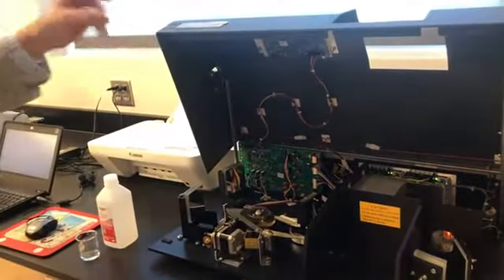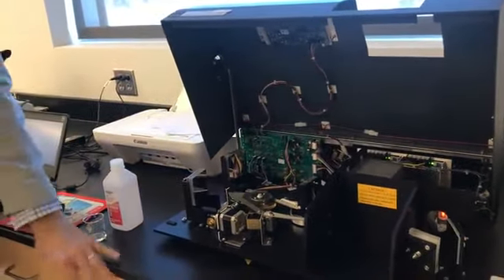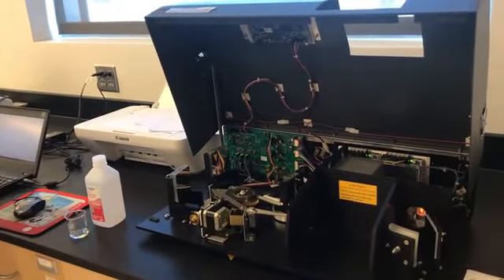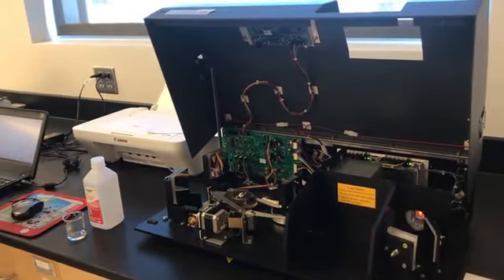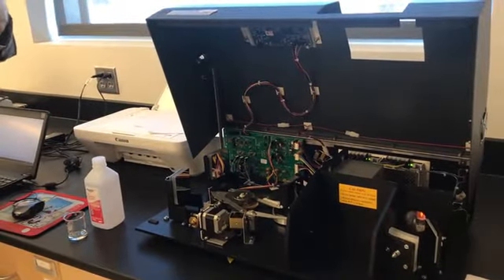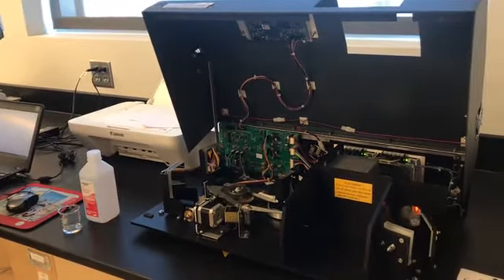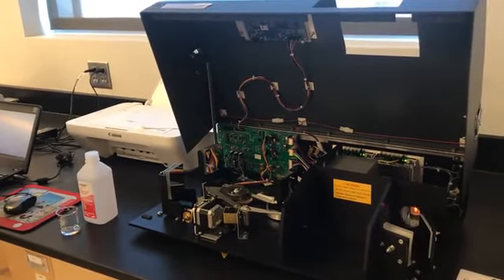Put the hood up on here, kind of like you put the hood up on your car. Okay, so this is the mid-infrared spectrometer we're going to be using. This is a dispersive instrument, so this uses a grating-based monochromator. This is not a Fourier transform instrument.